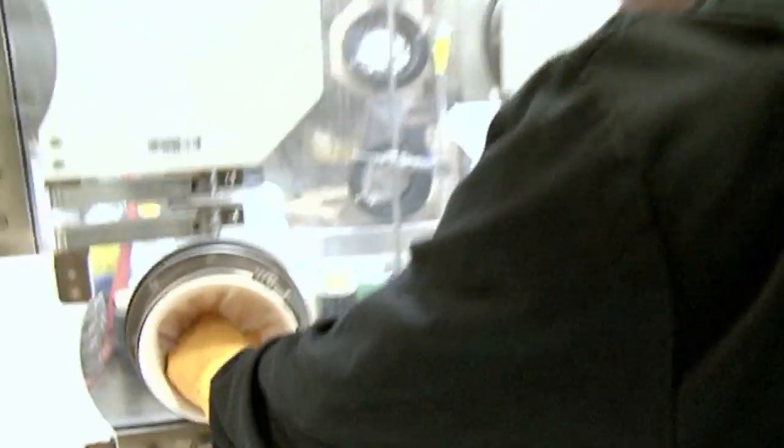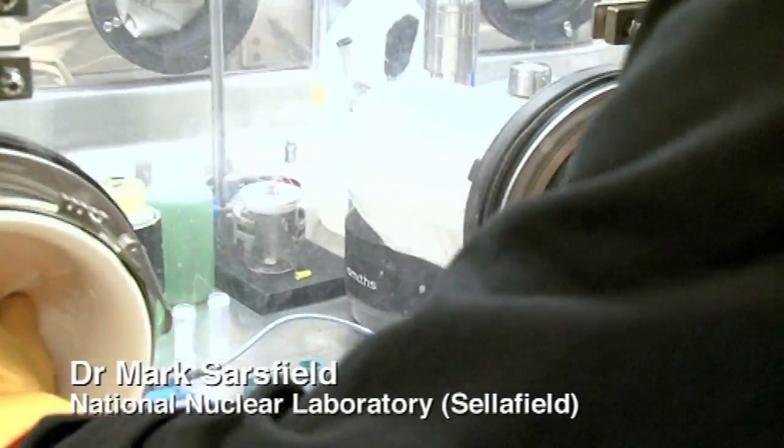Americium is really a very radioactive element, so it is handled in this glove box. I'm not qualified to use such equipment, so Mark, who works here, will tell us about it.